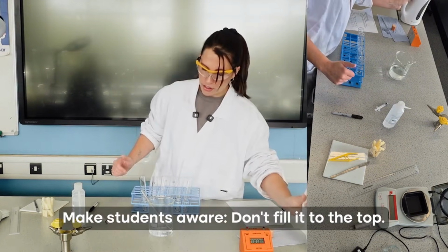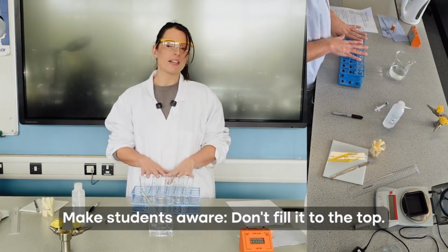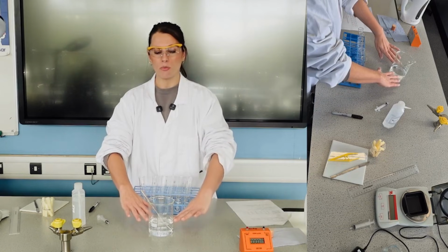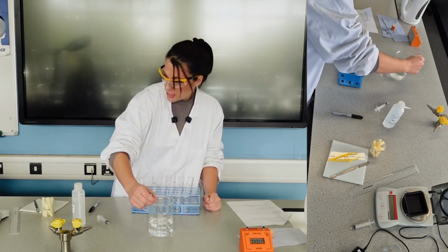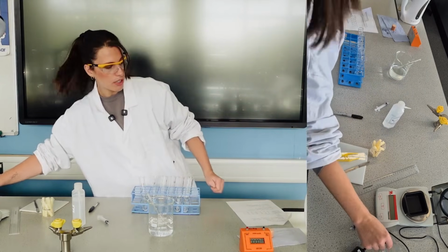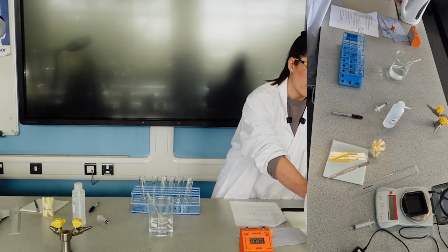Make students aware though, don't fill it to the top because by the time you've added all of these boiling tubes, the volume of the water is going to rise and it could overflow. Now that is 70. So I then add some cold water from the tap to bring that down to 30.